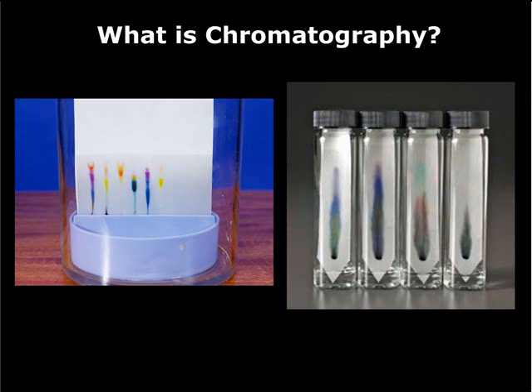Chromatography is a method of physically separating mixtures of gases, liquids, or dissolved substances. Chromatography can be used to identify drugs, poisons, and many other substances. Separation is determined by the molecular size and/or charge.